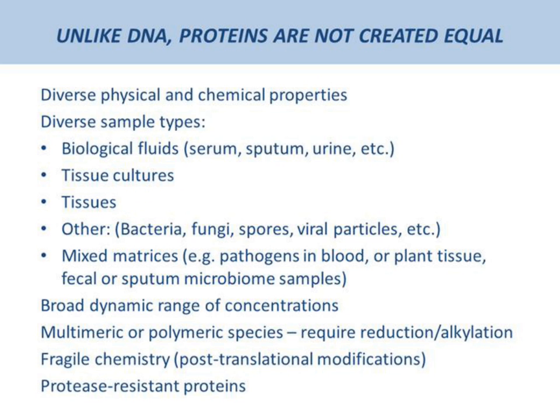In all omics techniques, quantitative recoveries and reproducibility are essential to achieve a desired experimental goal. Sample preparation for the historically first omics field, namely genomics, as well as for modern next-generation sequencing, relies on the fact that nucleic acids possess fairly uniform physical and chemical properties and can be easily treated as a distinct group. Moreover, nucleic acids are easily soluble in water and precipitate in organic solvents. They also specifically bind to chromatography support materials such as silica. Therefore, lots of commercial sample preparation kits are available today that utilize those properties of nucleic acids very well. Proteins, on the other hand, are very diverse and present in biological systems in a very broad range of concentrations. Low abundance proteins cannot be amplified as nucleic acids. Therefore, the optimal choice of sample preparation in proteomics heavily depends on sample type and chosen downstream analytical workflow.